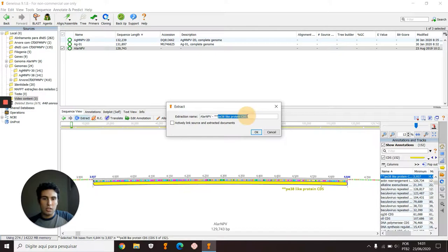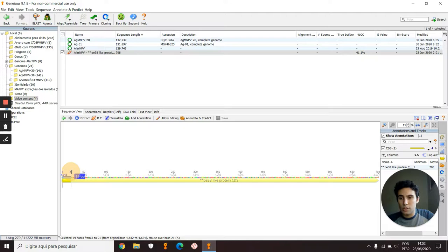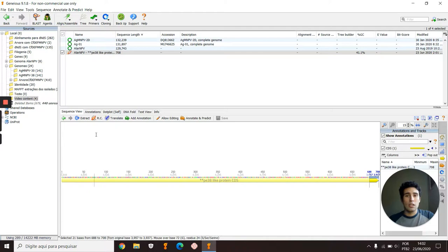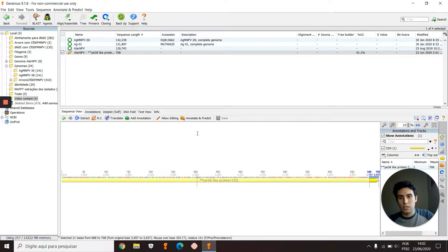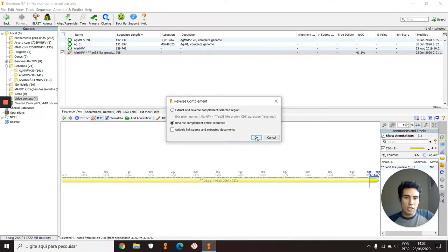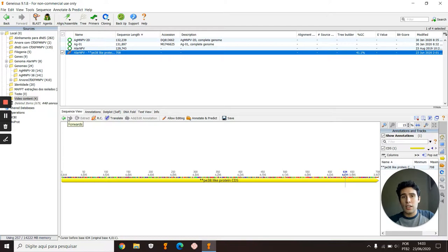Here is the genome name and the gene name. Here is the amino terminus portion of this gene and the carboxyl terminal portion of this gene. If for some reason you want to analyze this in the reverse sense, you can do the reverse complement here in this option.